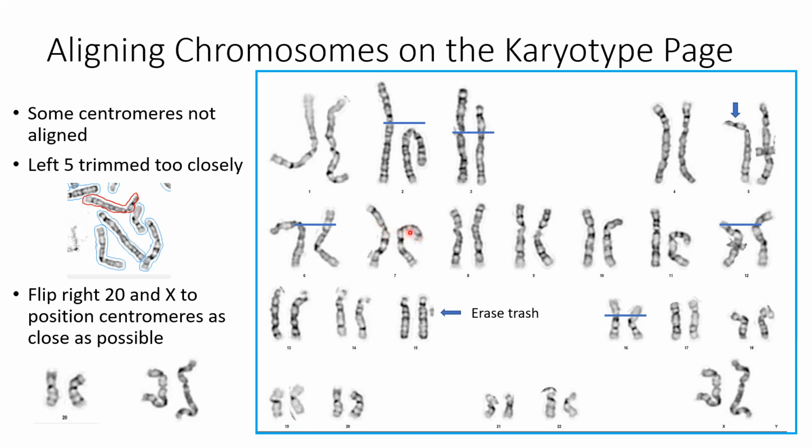See, these are lined up and they oriented it correctly. But if this had been flipped horizontally, then you're going to put most of your chromosome out here, and I can show you sometime the difference. If you put most of your chromosome out here and this is over here, it's too hard to actually do the analysis.